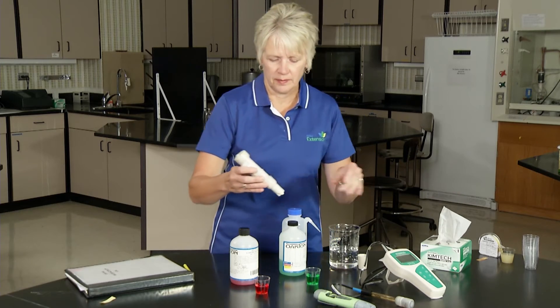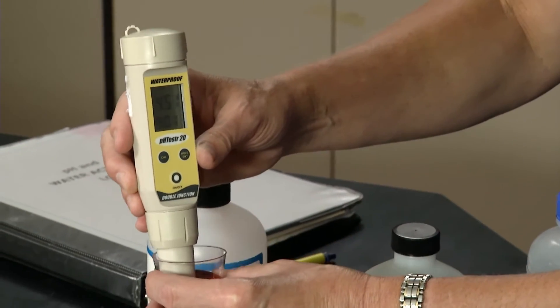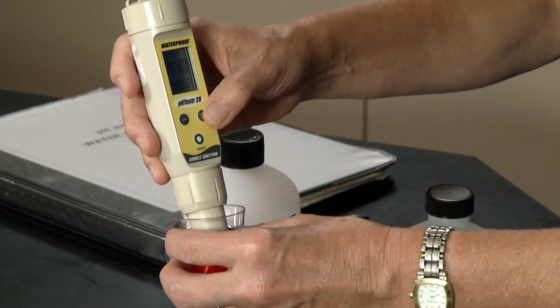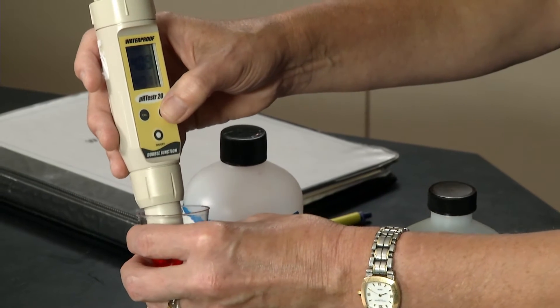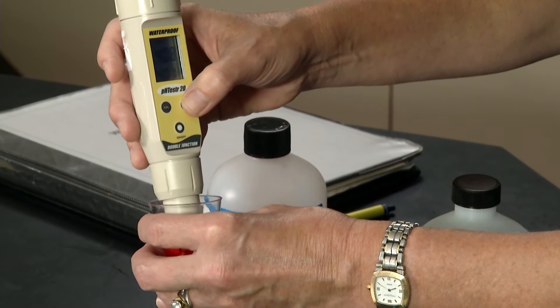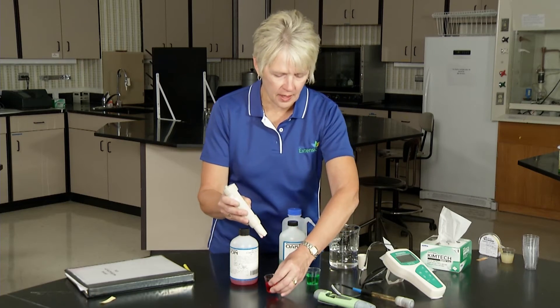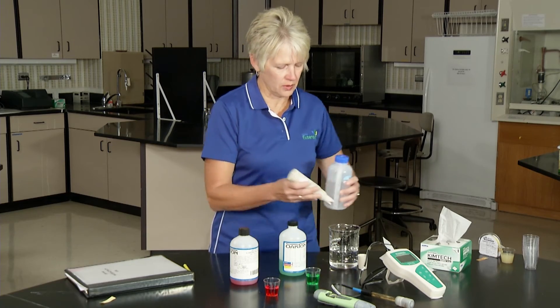I'm going to dab the tip a little, then I will put it in the 4.01 buffer. When the top number starts to hover closer to 4.01 and it starts to stabilize, that is when I press hold enter. It's hovering about 4.05, 4.06 — and there we go. Notice I left it in there when I pressed the hold enter button.